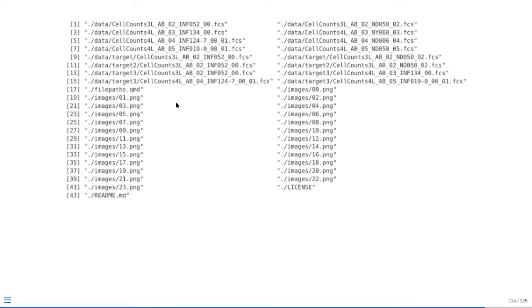The one thing I should caution you is you should make sure it's working within a small working directory, because if you accidentally run this on one of the very large folders of your system, if you run it on your home directory on Mac or Linux, or if you run it on your C drive if you're on Windows, it's going to take a very long time to index and list all the files that are present on your particular computer. So use it with a little bit of caution, just so you don't have to abort R because it's stalled trying to do all this effort.